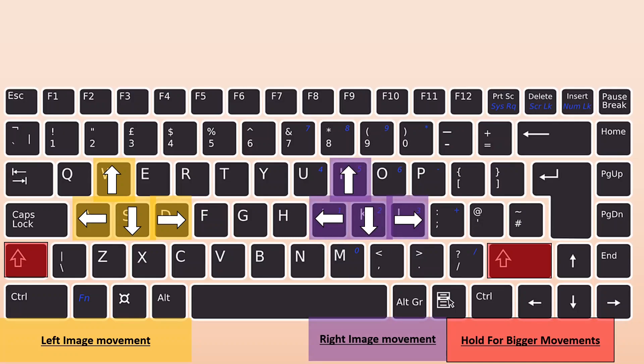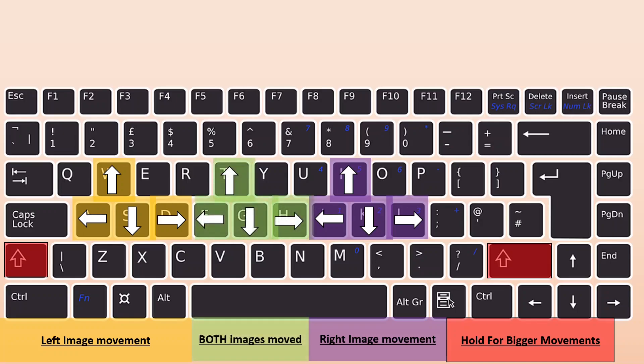If you want to move both of them together at the same time, you will use the TFGH keys just like that. So same kind of layout. Those are the keys you're going to use.